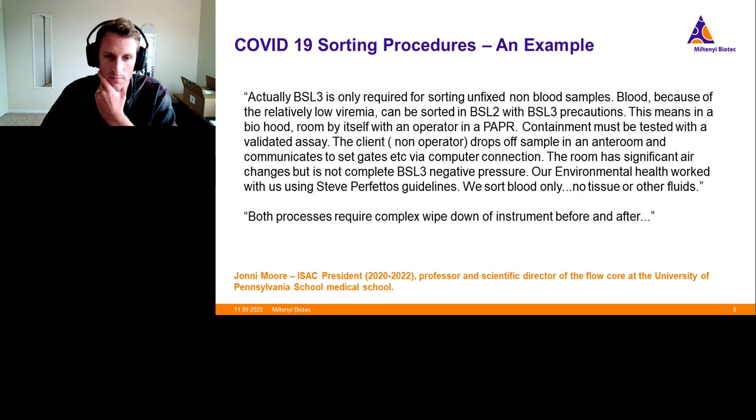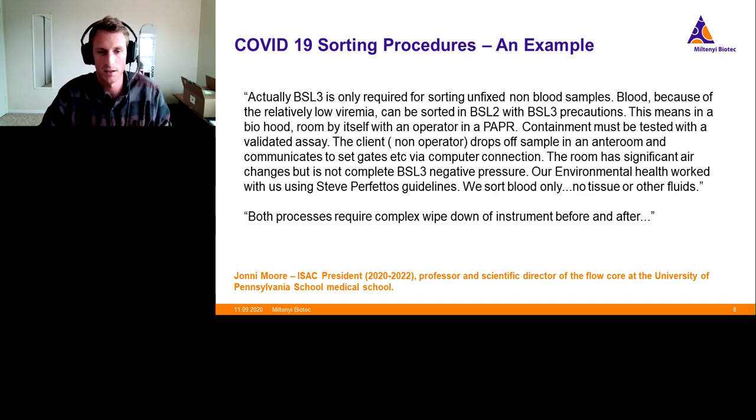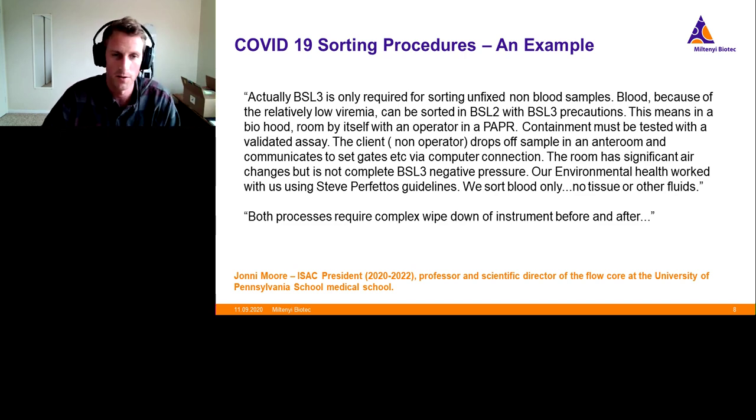But there are parts of working with these instruments that require somebody to be physically next to the machine. The operator will obviously have all this PPE, but in the interest of not gowning up everyone, usually in this case they have asked the individual who brought the sample in to sit in a remote location and guide the sorting experiment from elsewhere.